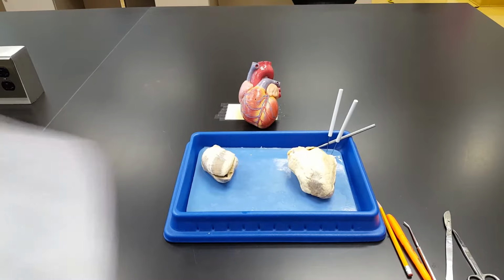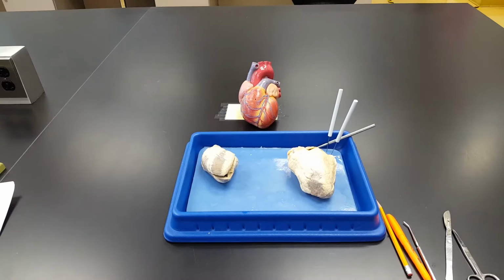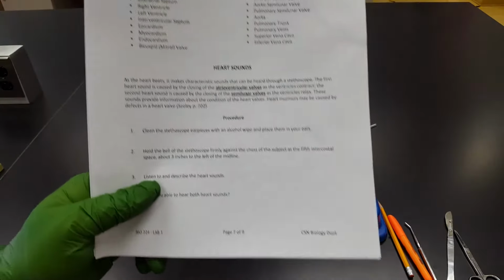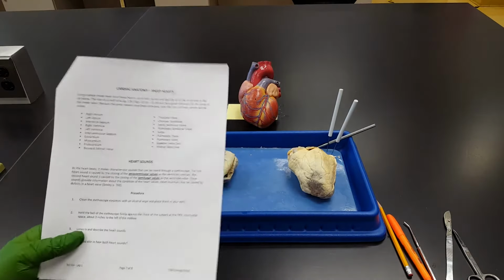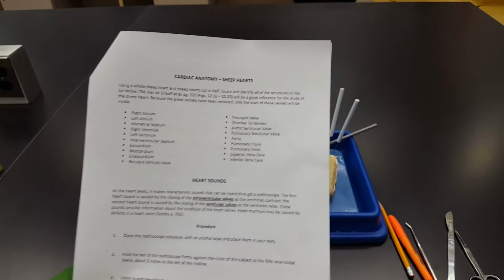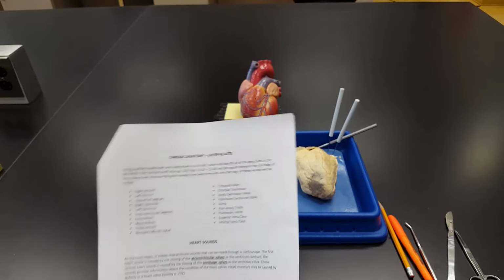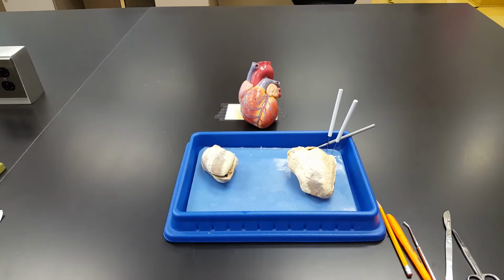Now remember, for your study, it's just this list right here of structures that I'm allowed to ask you in this sheep heart dissection. And consulting the list, you will notice that there aren't really many external structures. You don't see any apex, you don't see any coronary vessels. It's only these structures that are fair game for that lab quiz, which aren't really structures that are that difficult for us to see or find, with the possible exception being the great vessels. Those vessels that are actually connected to one of the chambers of the heart.